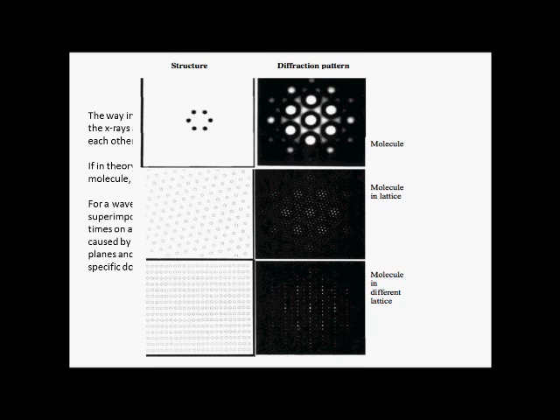Also, what's important is the angle of the incoming X-rays compared to the plane, and the X-rays will be diffracted off at this angle as well. This means that crystals are very selective in the angles at which they diffract, which is why you get a discrete pattern of spots on your detector when you're looking at an entire crystal. So when you've got a diffraction pattern for an entire crystal, the angles of the diffracted waves, those spots, are determined by the structure of the lattice, and the only piece of information that you can link to the protein itself is the relative intensities of these spots.